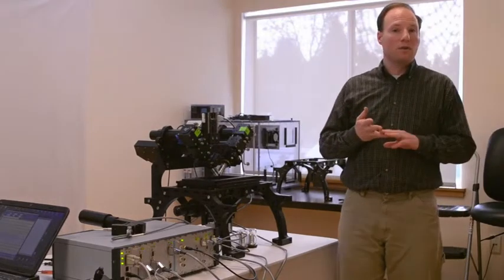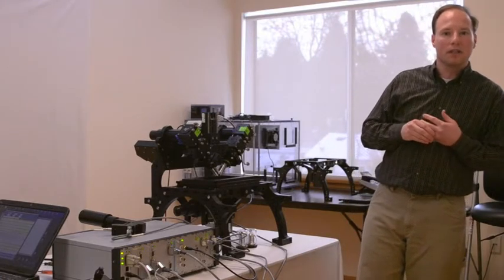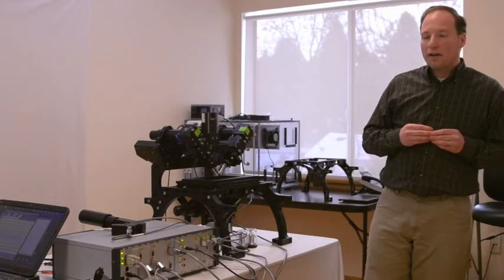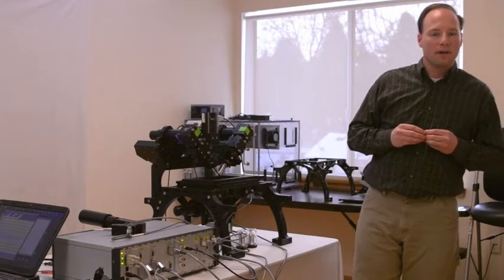Third, we have low photobleaching, because we only illuminate one plane of the sample at a time. So usually the light dose is less than 10% that of confocal. And finally, we achieve rapid frame rate up to 200 frames per second.